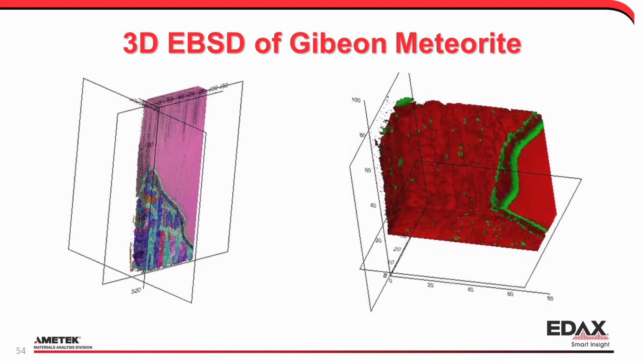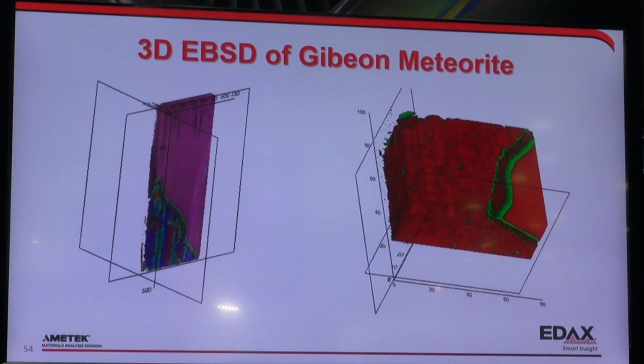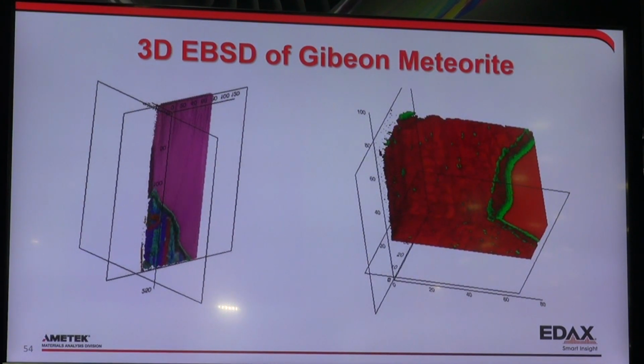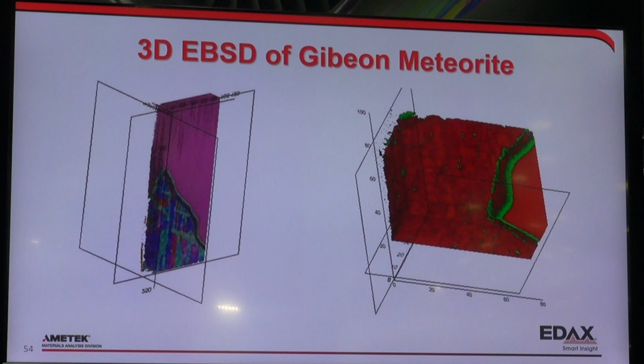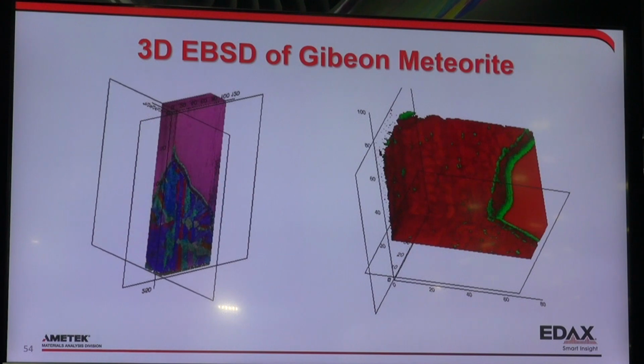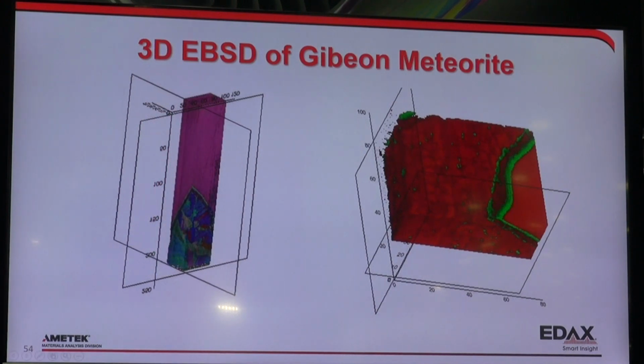This is a large scale 3D section, and it's running, it's just a second. So this is looking at the boundary from one of the large grains to some of that finer structure, just to show some 3D runs in it. And you can see the shape of a shell through here. There's actually a phase boundary that goes through that. So that's what we see here.